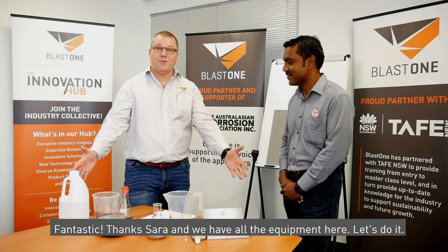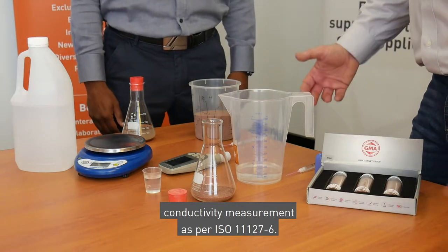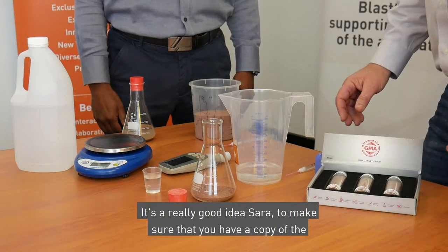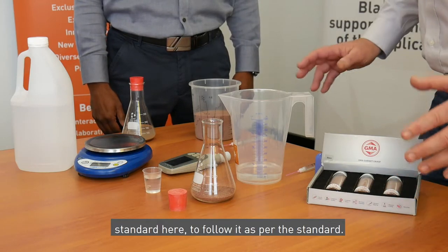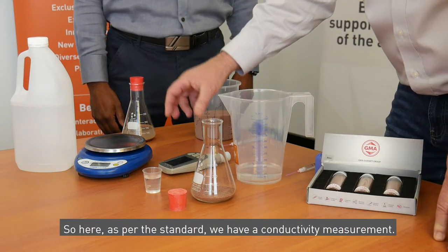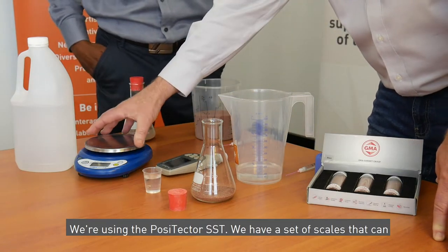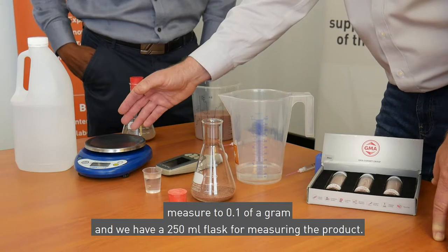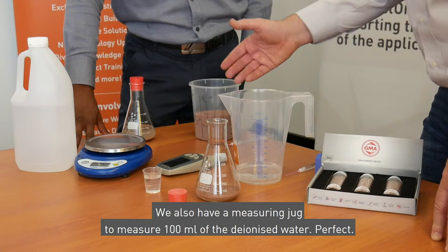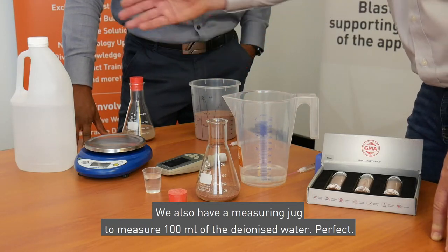Fantastic, thanks Sara — we have all the equipment here. We're about to conduct an abrasive conductivity measurement as per ISO 11127-6. It's a really good idea to make sure that you have a copy of the standard here to follow it. As per the standard, we're using the Positector SST for conductivity measurement, a set of scales that can measure to 0.1 of a gram, a 250 ml flask for measuring the product, and a measuring jug to measure 100 ml of deionized water.